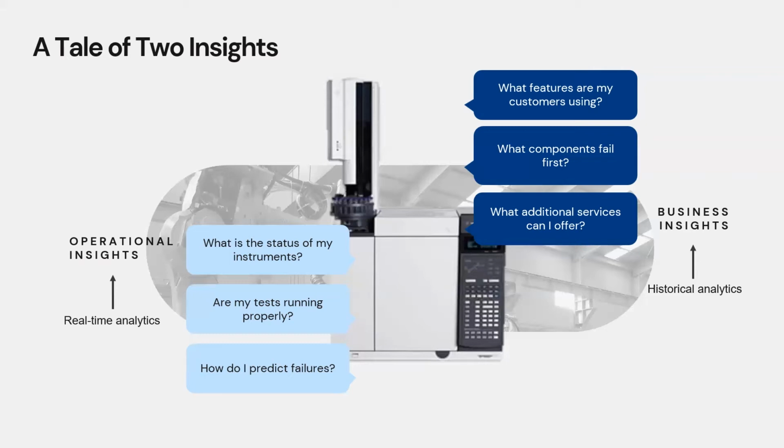Those business insights are more for long-term strategic operations, and they're done through looking at historical data. Both types of insights are very important for different purposes.